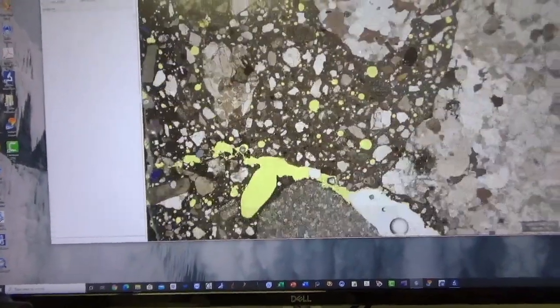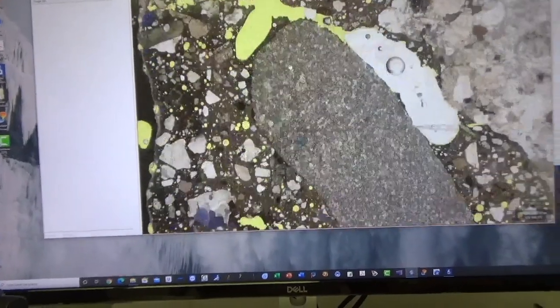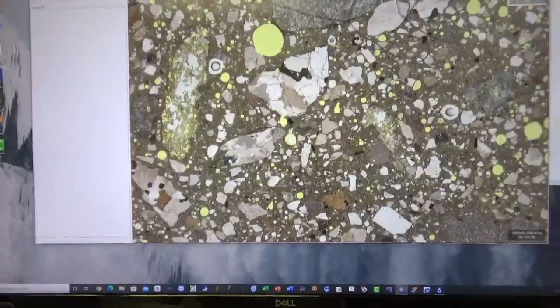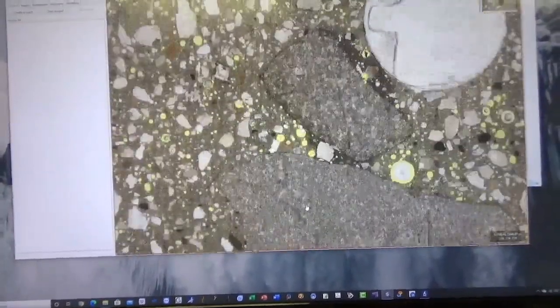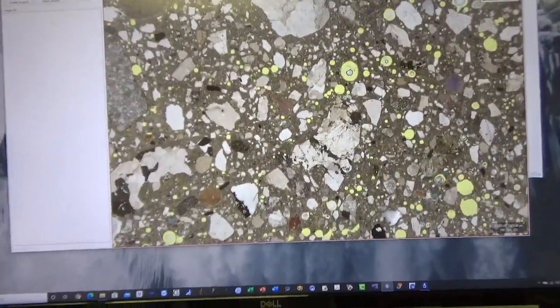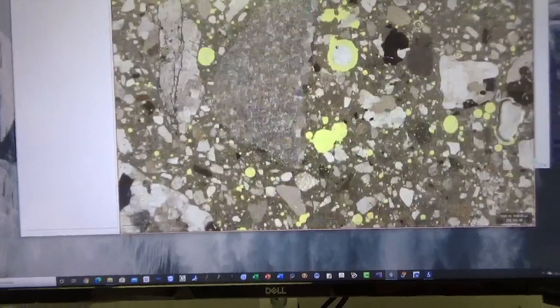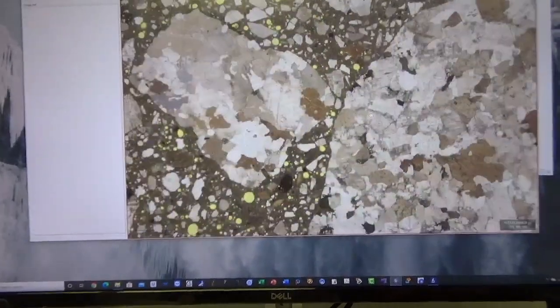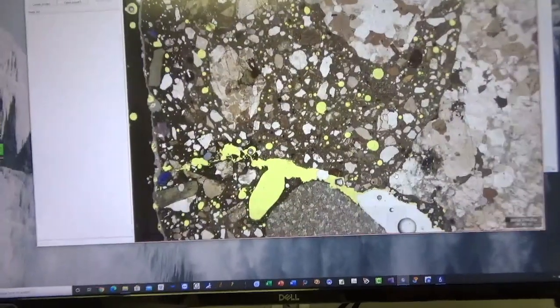All that information can be retrieved from this whole slide image by using ImageJ, following the flatbed scanner method of procedure C of ASTM C457. You can use procedure C on this scanned image to highlight the air voids in white against everything else in black.